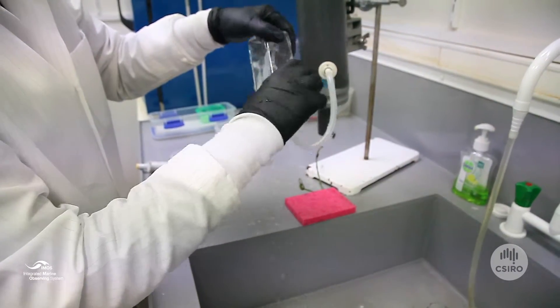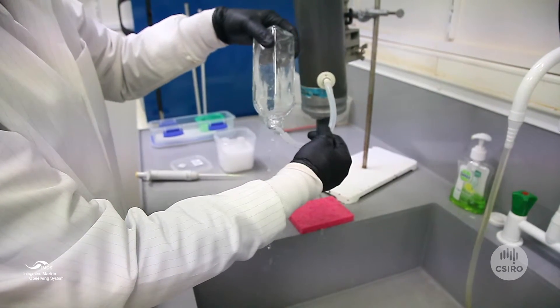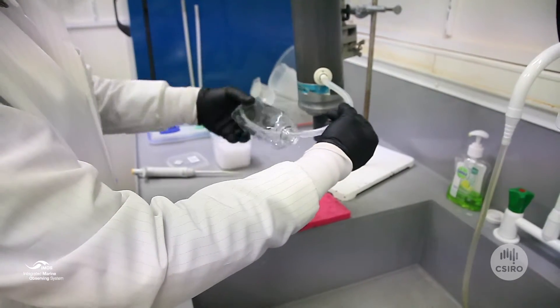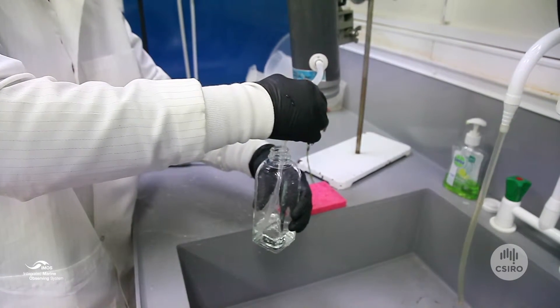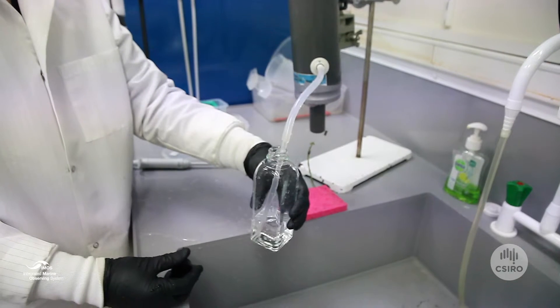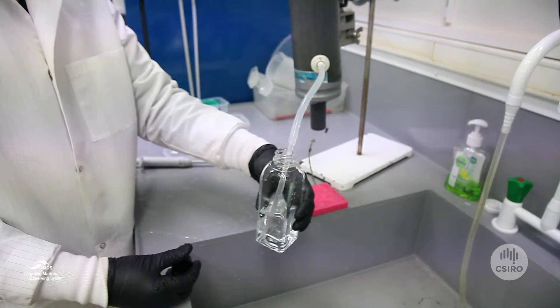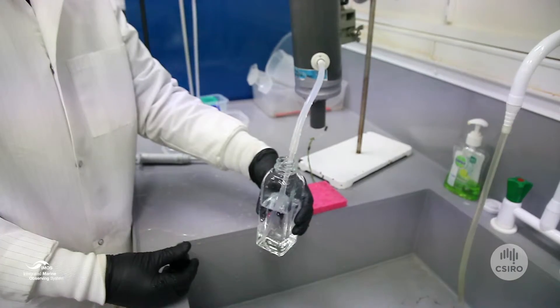Now pinch the tube to stop the flow into the bottle. Turn the bottle back over and start the flow again very carefully so as not to introduce any bubbles into the sample. Allow the bottle to fill and overflow.